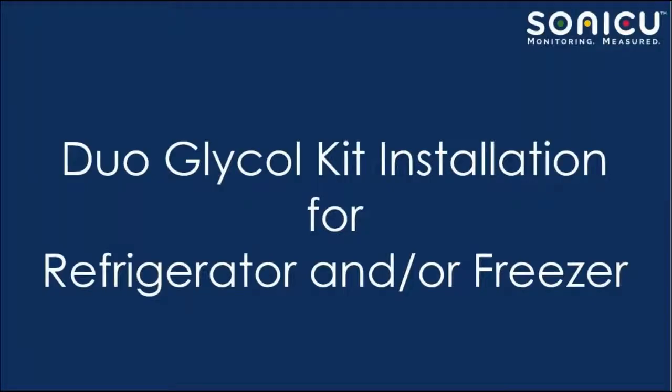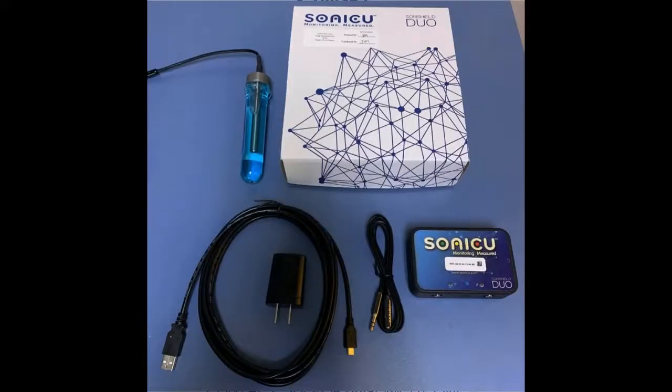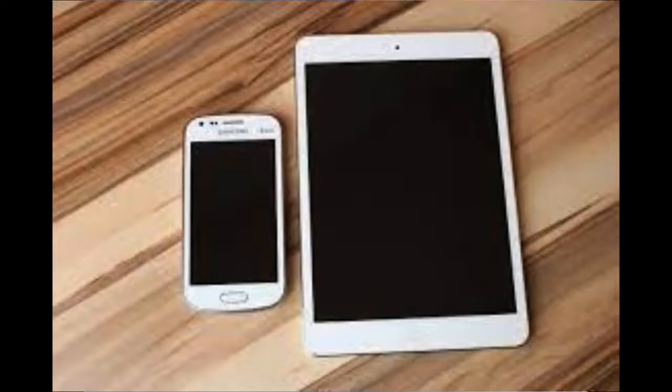The dual glycol kit for a refrigerator or freezer installation includes a meter, sensor, sensor cable, power cable, adapter, and a reset pin to turn your meter on. You will also need your mobile phone or tablet to complete the installation process.